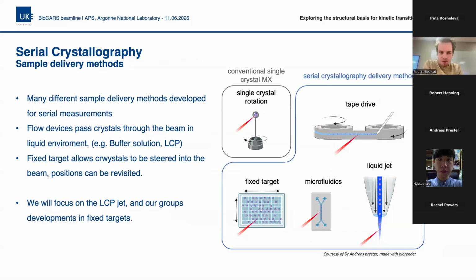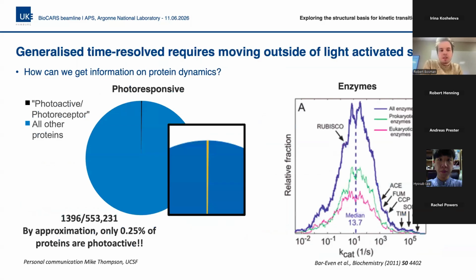And as I was mentioning earlier, what we're really trying to do is shift ourselves out of being totally dependent upon the photoresponsive systems, which have been studied extensively within some very nice studies, and into looking at more enzymological systems by developing the ways in which we're doing the pump of our system.